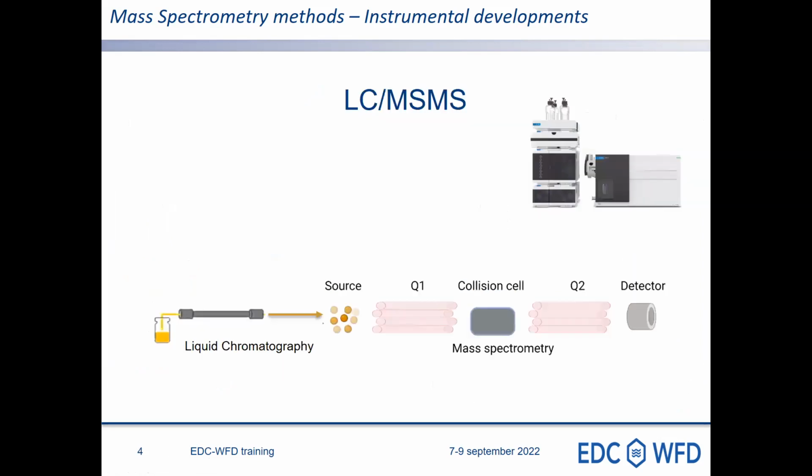So let's start with LC-MS-MS. Just to inform you, within the project we have only focused on electrospray ionization approaches.